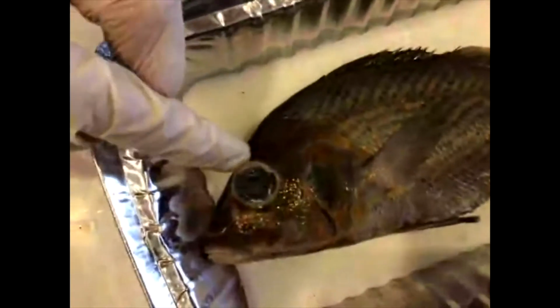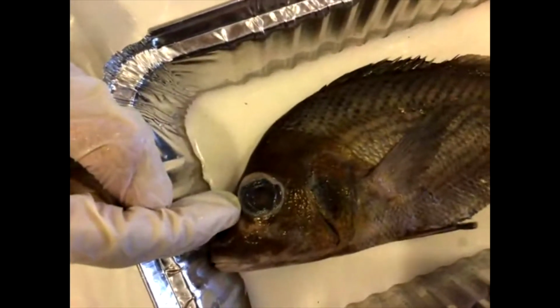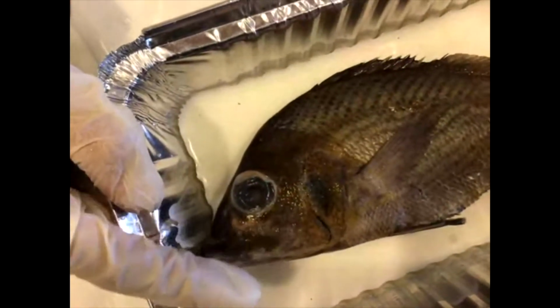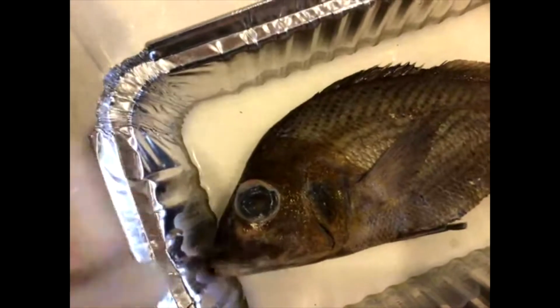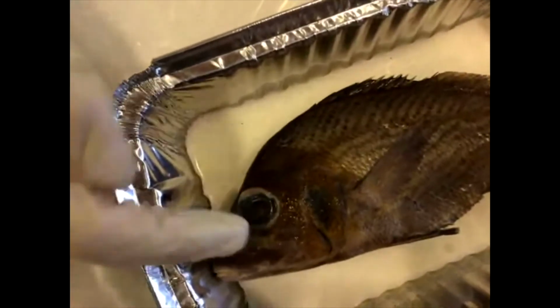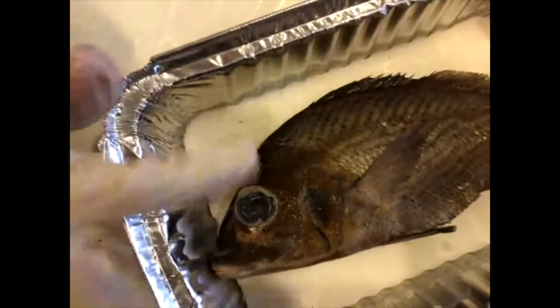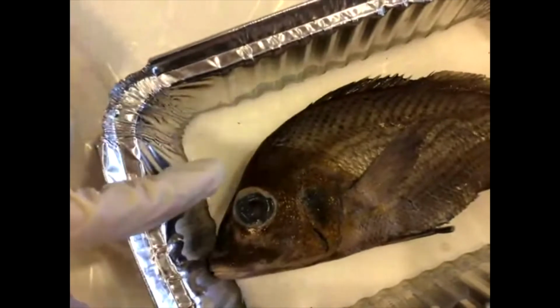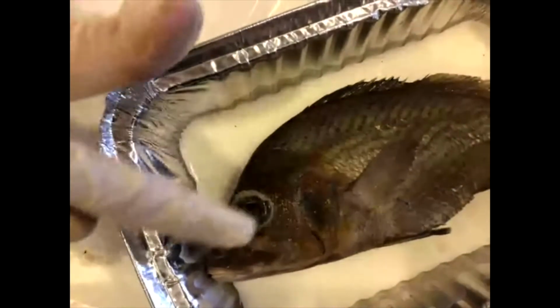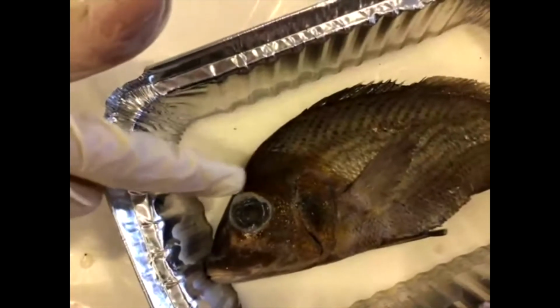And this is an interesting eye because it's much more developed than a lot of the eyes that other animals have in the ocean. Animals like crabs, snails, sea stars, they may be able to detect light, but they don't have a fully formed eye like humans do that can actually generate pictures. But a fish's eye is actually quite evolved, and so they can see more similar to the way that humans see, and they actually have this little eyelid here. So you can draw an eye on your fish, and you can draw the little eyelid too if you'd like.